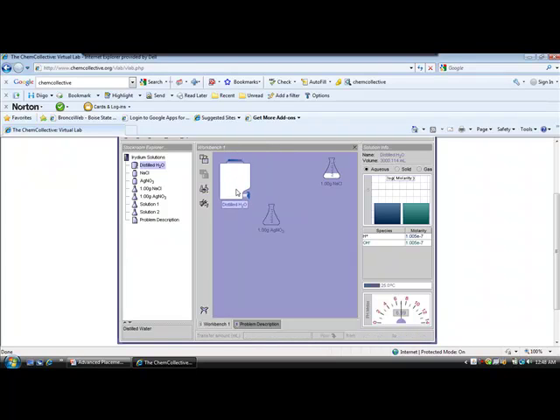Another way to do that is to just drag, as you would in a video game, the Erlenmeyer flask over to the other container, and in touching the two, you should be able to. Yeah, it's not going to let me do that. So I set that as the source, I set that as the recipient, and I'll show you how to connect those later. I want to transfer, I'm at the bottom now, 100 milliliters of distilled water, and you can hit enter or you can just pour, and I've now added 100 milliliters of distilled water to my silver nitrate, my 1 gram, and now it looks similar to the sodium chloride container.